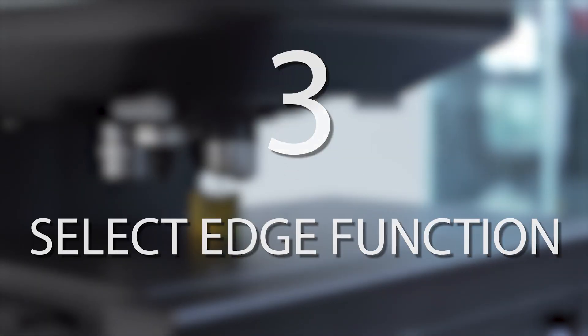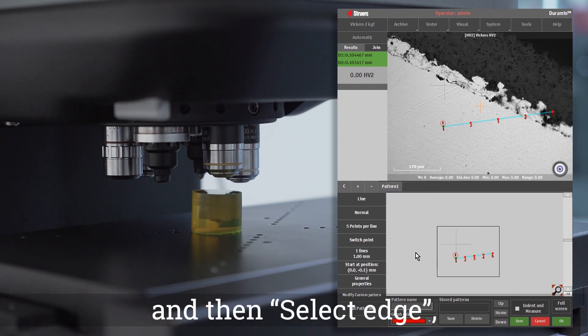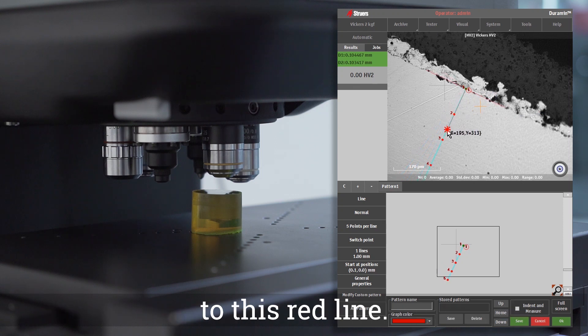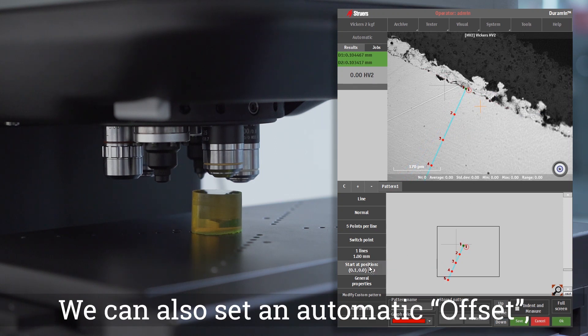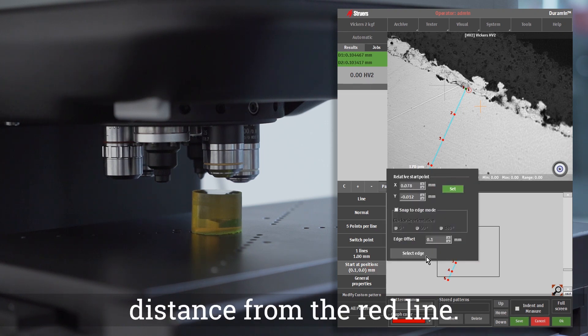Select Edge Function. If we go to Start at Position and then Select Edge, we can position a pattern perpendicular to this red line. We can also set an automatic offset, so our pattern will be at a specific distance from the red line.